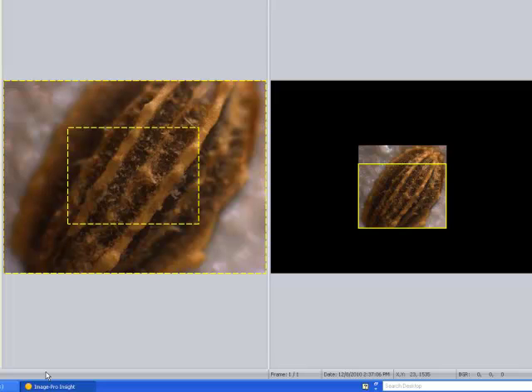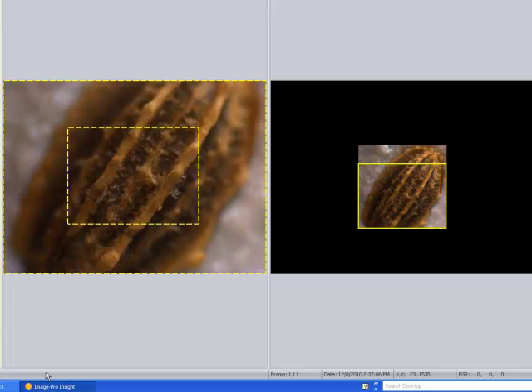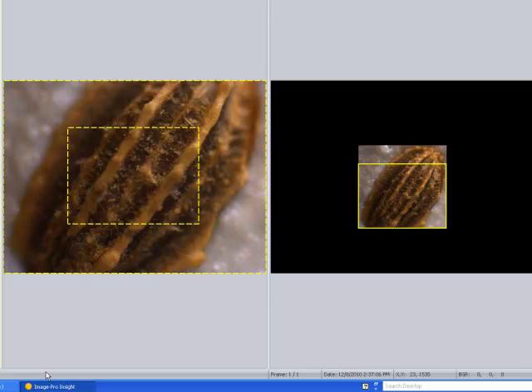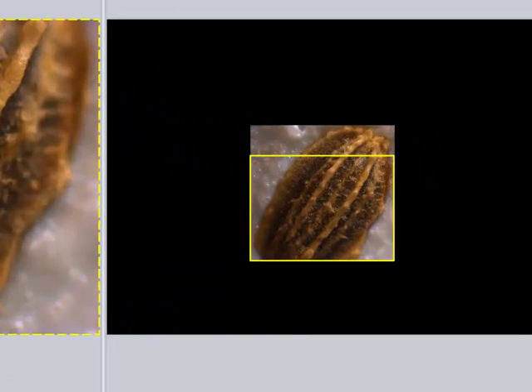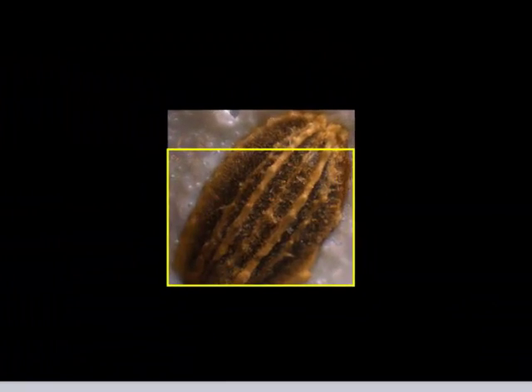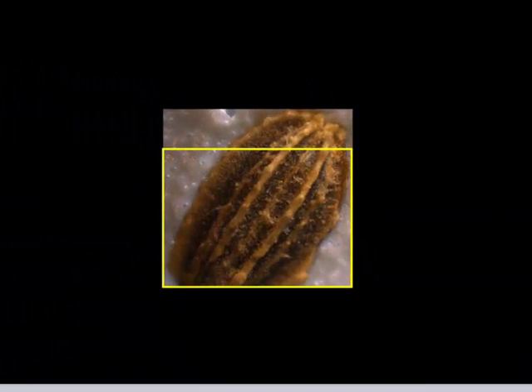but now I grab the focus knob, and I begin to focus down through the section. Going the opposite way I did before, I focused up through the section, now I'm going to focus down through the section until I get to the bottom of the seed.